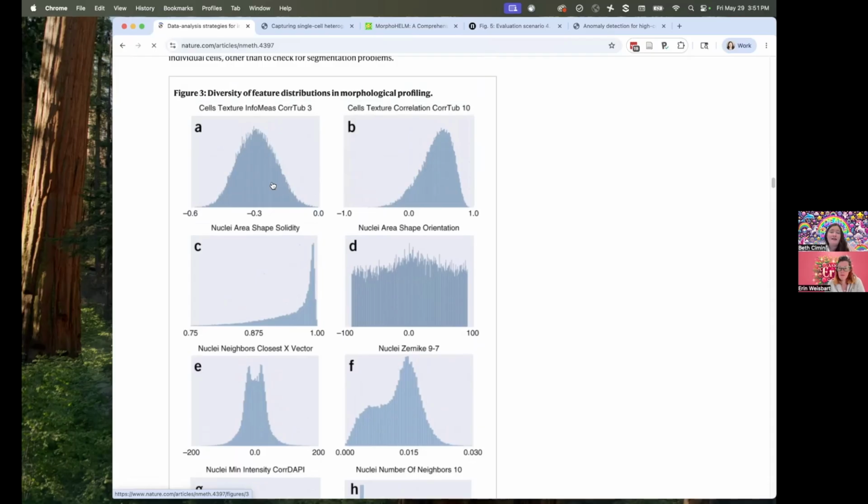By normalizing them with the median, we at least make sure they're on the same scale, since some go from negative to positive, some are minus 100 to plus 100, some are 0 to 1. We can at least get a sense of how far we are from the middle of the response, whatever that is.